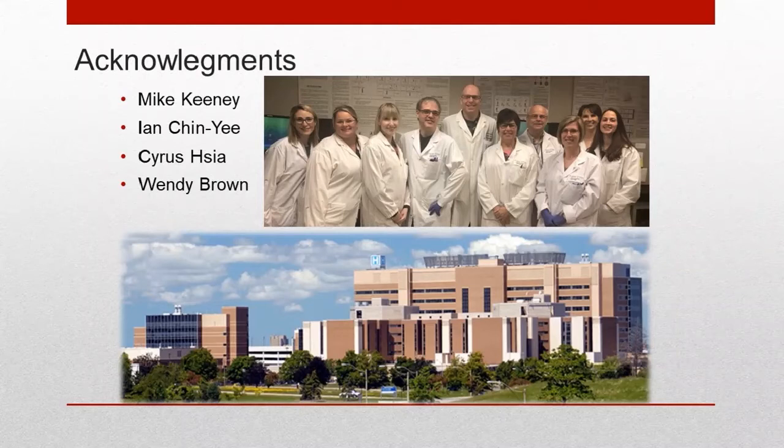I don't know all of their names, but I know that there were a lot of people involved in it, and we actually have a publication that is in press right now, so that will detail a little bit more about how the combinations were come to. But the brief answer is yes, the Bethesda guidelines from the WHO 2016.